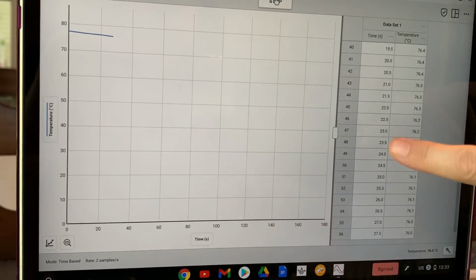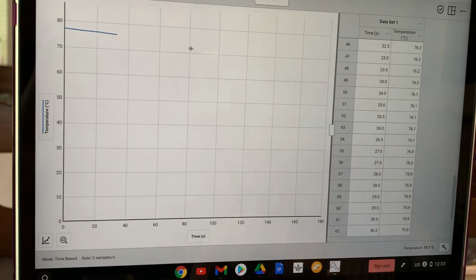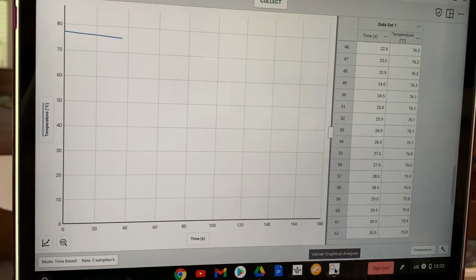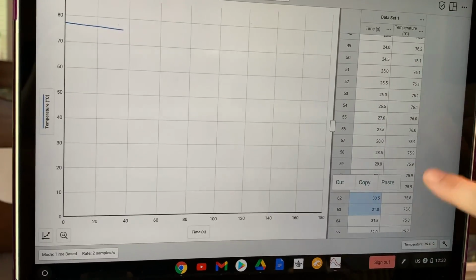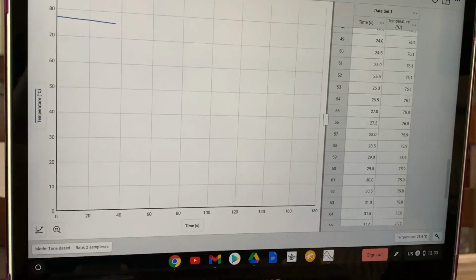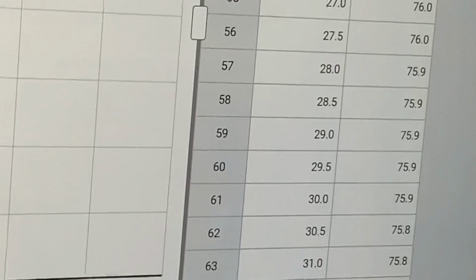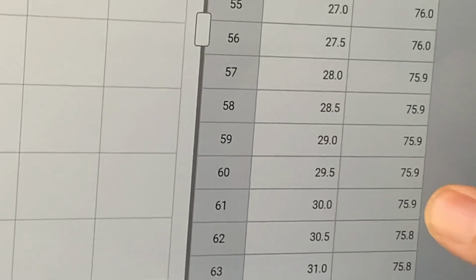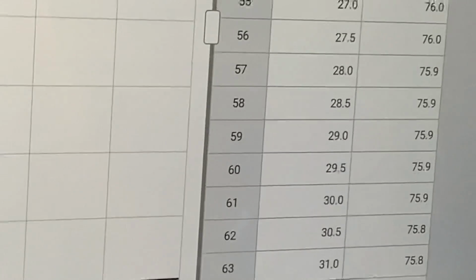Right now, you can see on the data table that we just hit the 30-second mark. So I'm going to stop our collection, and we're going to zoom in at 30 seconds. So this is 30 seconds. Let's see if we can see it. At 30 seconds, it was 75.9 degrees Celsius, which is right here. So we're going to record that on our thermometer. We're going to round that up to 76 degrees Celsius.